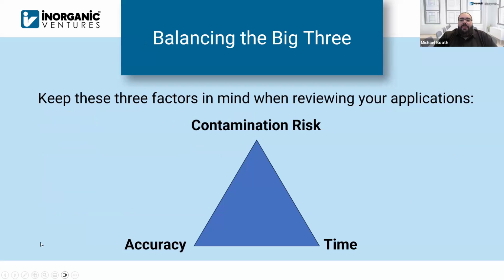So we will sit down with folks if they have a question about what standard is right for them. And in those conversations, I typically keep these three factors in mind. First off is, we talk a lot about contamination. It's one of our most popular topics that we review when we do either our ICP conference or seminar appearances. Everyone loves to talk about contamination risk. So that is something to keep in mind. Like I mentioned before, if you're doing high dilution factors, even a very small trace amount of contamination can appear to be very large after you've applied your dilution factor. So that is something to keep in mind.